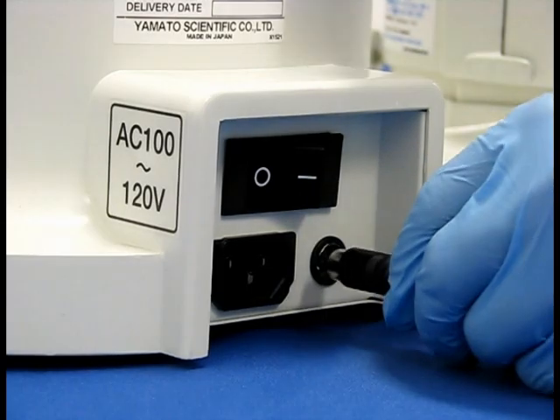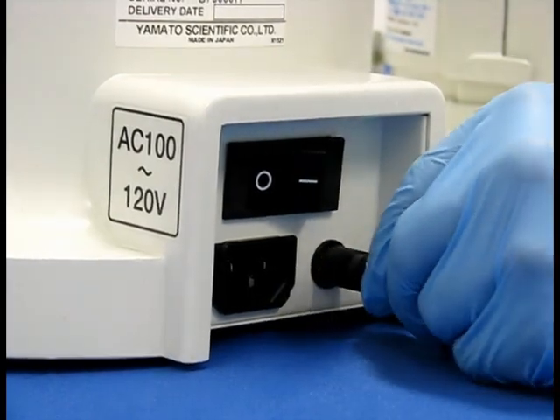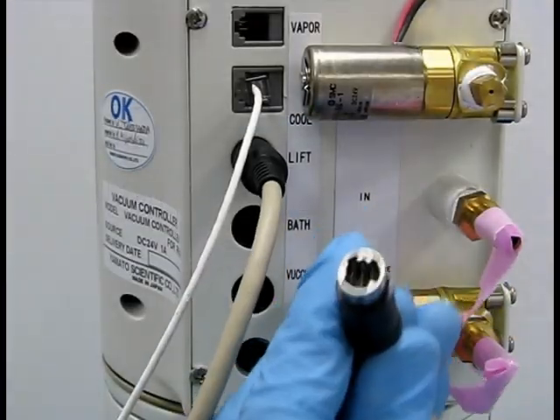Take the bath harness and connect one end to the back of the water bath and the other end to the bath terminal of the vacuum regulator.